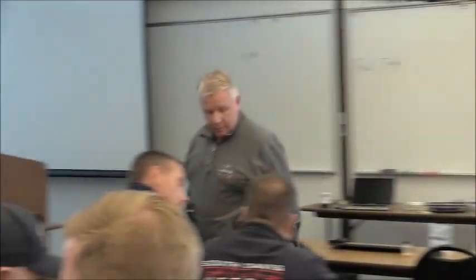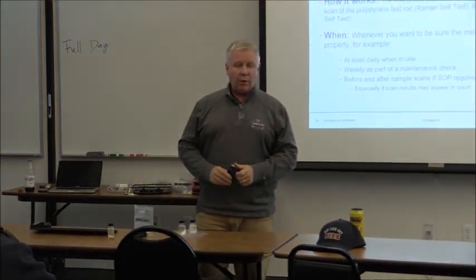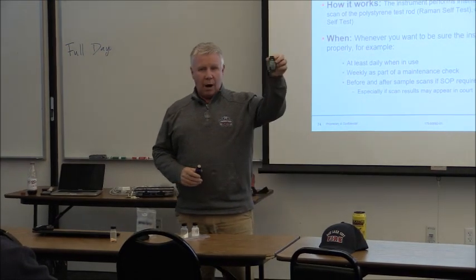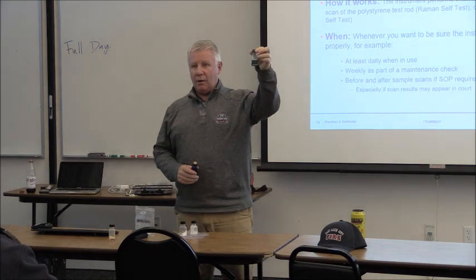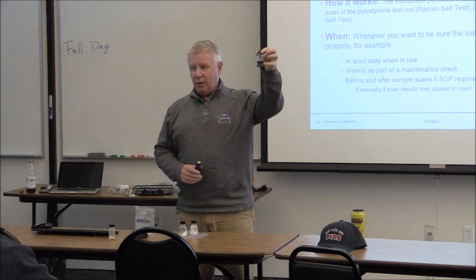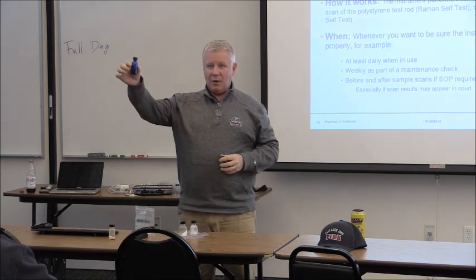Okay, how are you? Beautiful. So I want to ask you a question now. This relates to the Raman. Remember we talked about color in the Raman. Should the Raman see this? What color is the container? Clear, so I can see the liquid. The liquid is dark and it's colored. What about that? I don't know. That's what the Raman does.